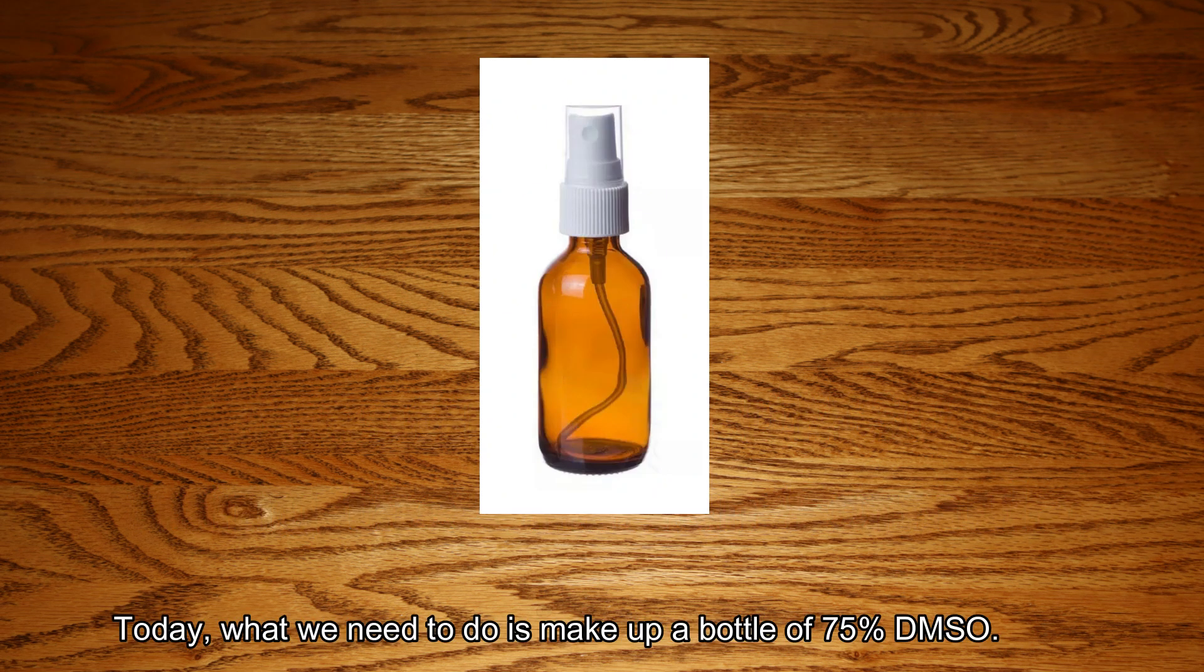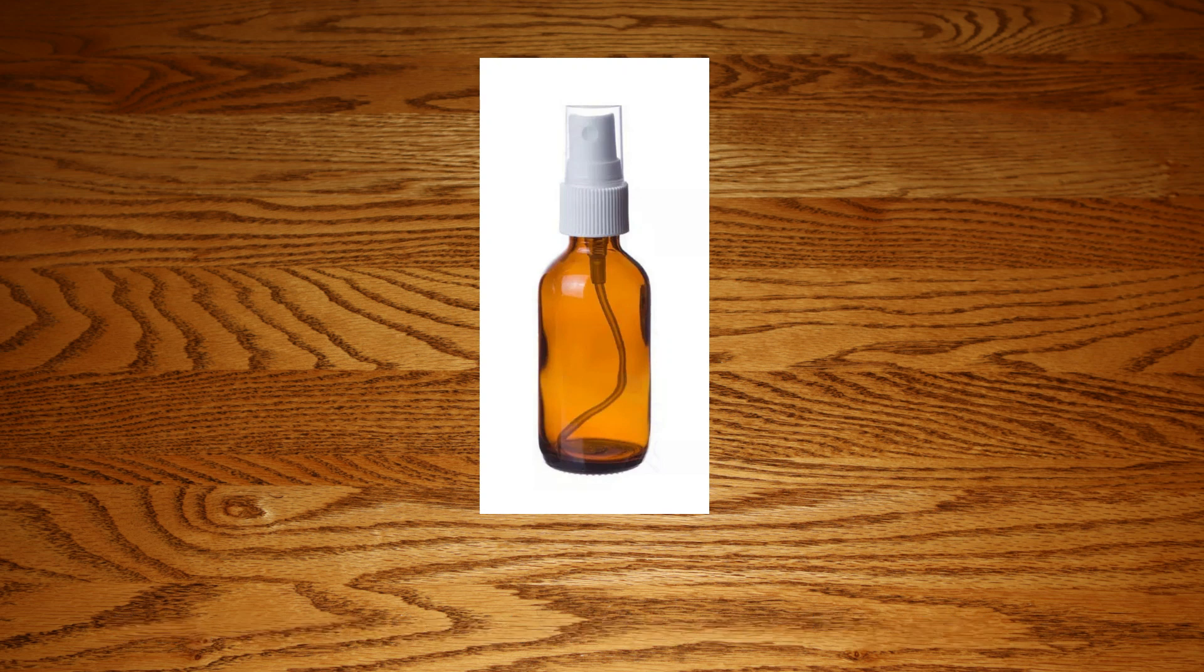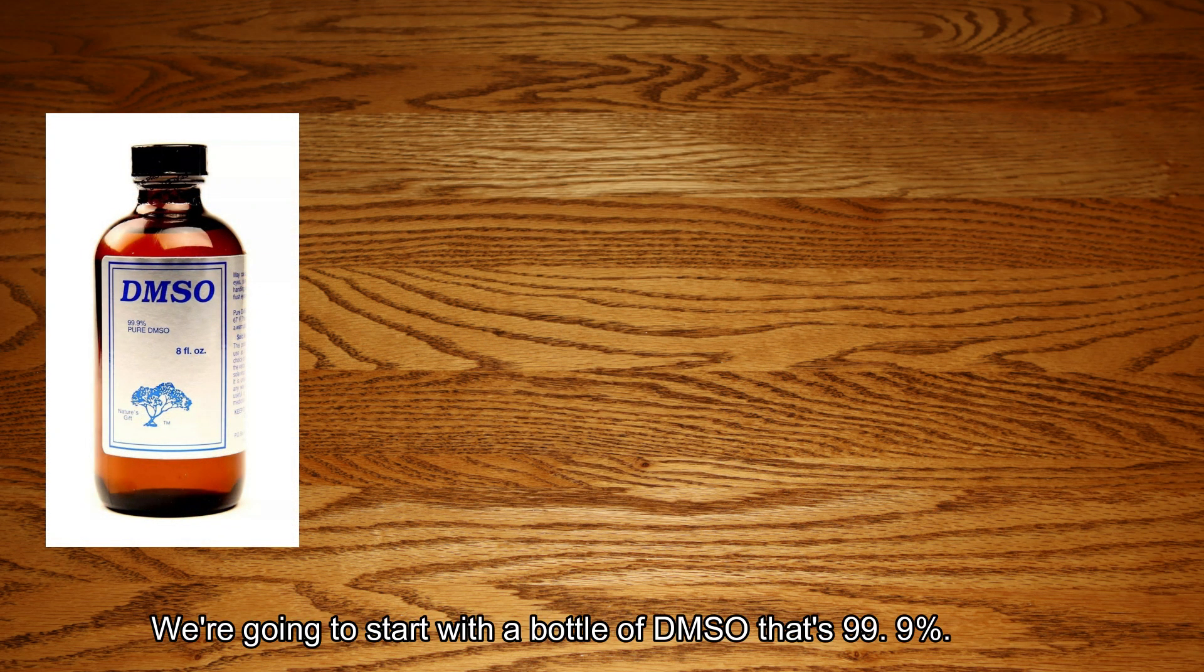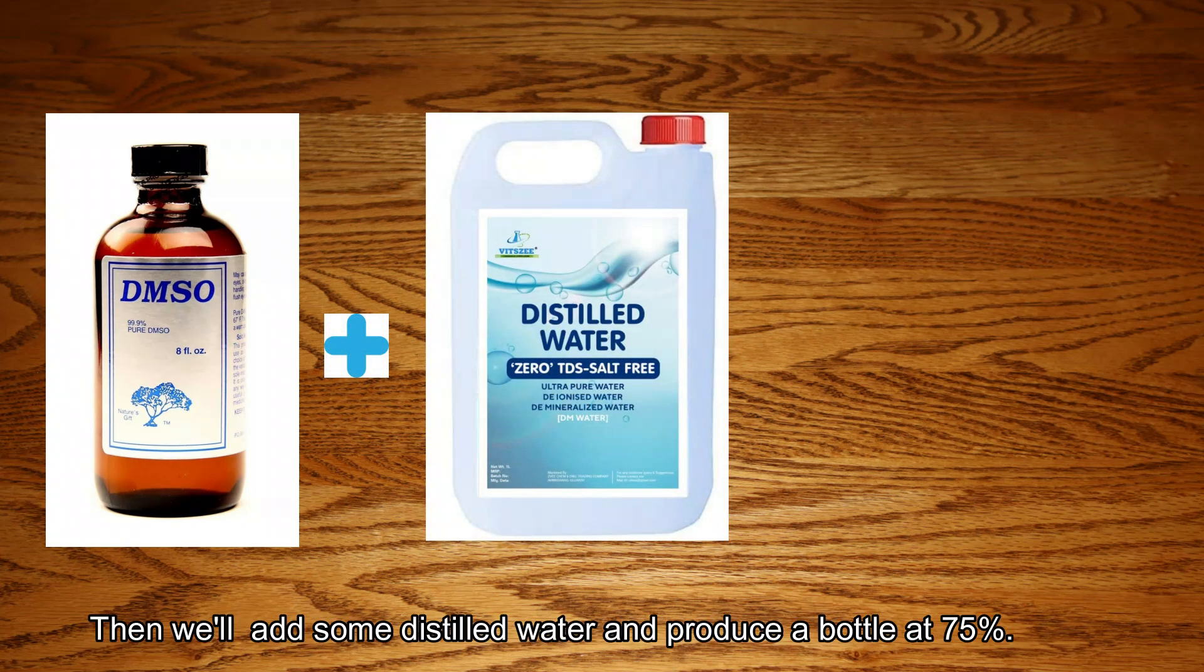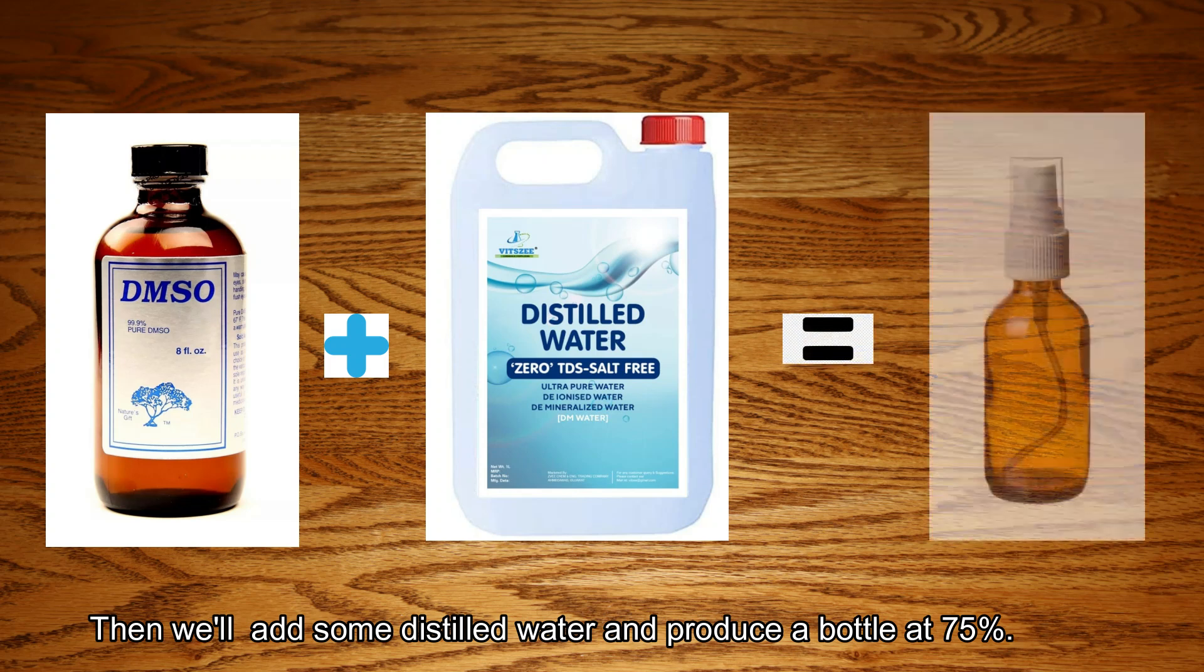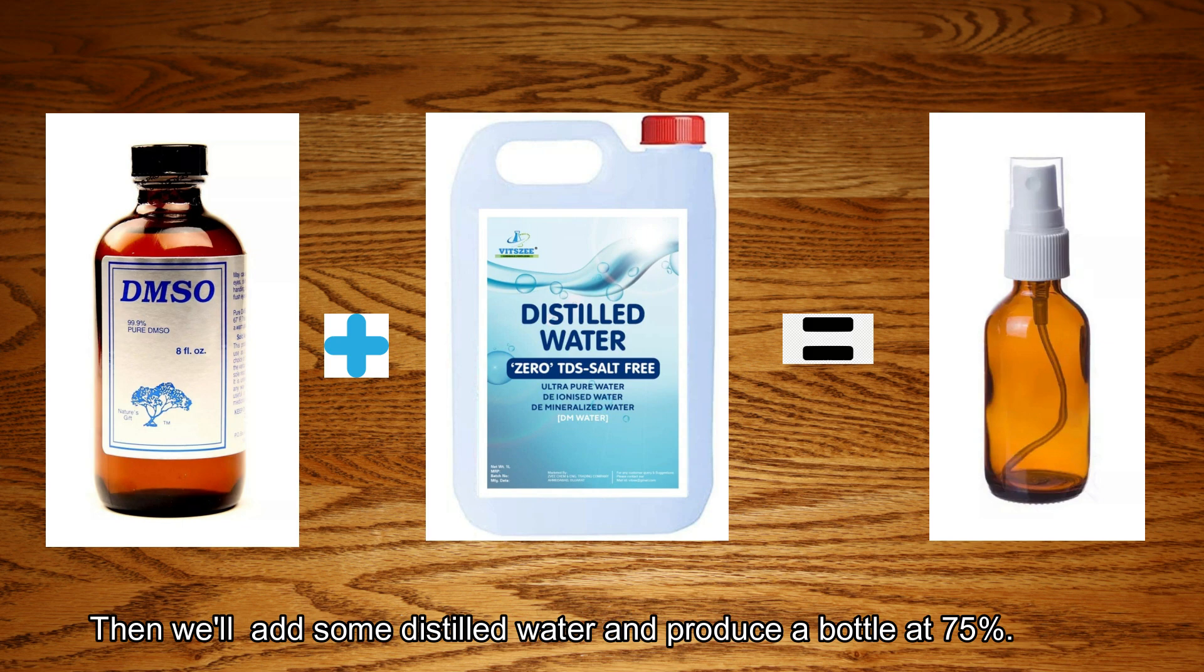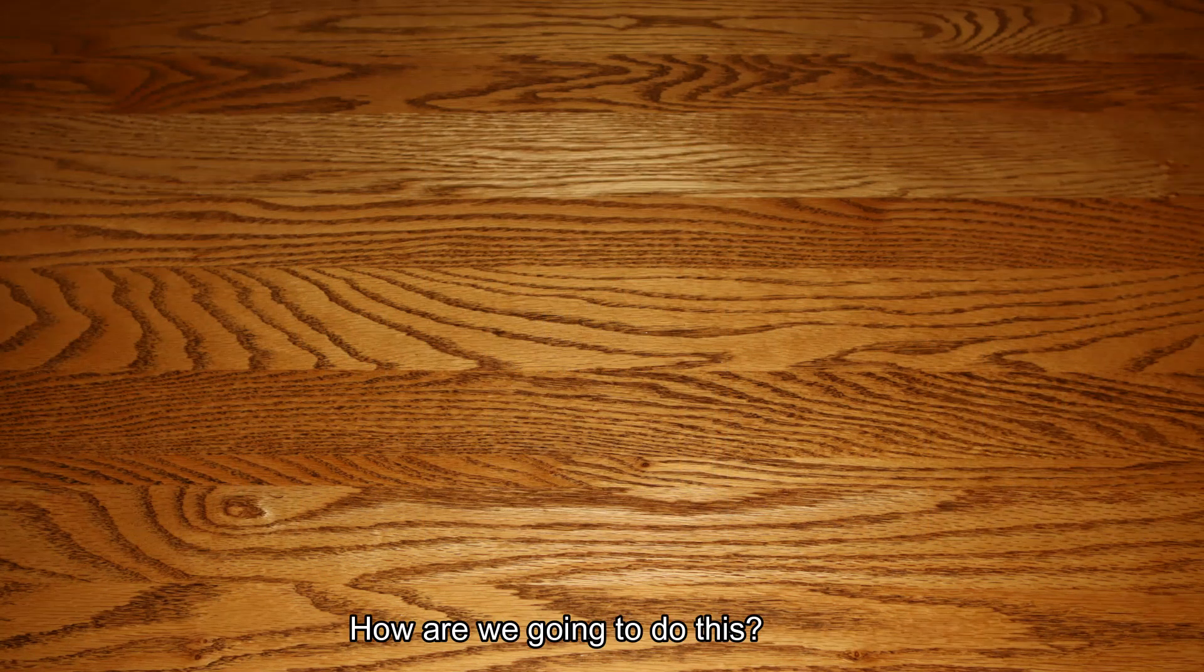Today what we need to do is make up a bottle of 75% DMSO. We're going to start with a bottle of DMSO that's 99.9%. Then we'll add some distilled water and produce a bottle at 75%.